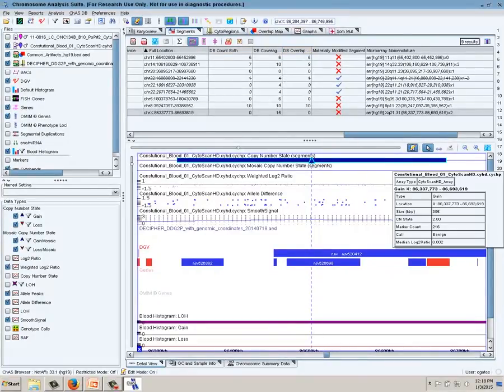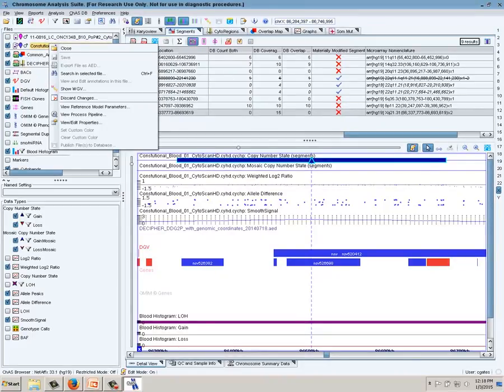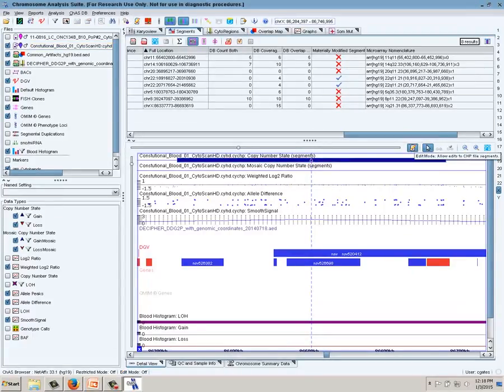If I go to publish by either right-clicking on the sample, you can see publish files to database is grayed out. Or this icon up here is also grayed out. It's just a safety feature, you cannot publish in edit mode. So if it's ever grayed out, you can say, I must still be in edit mode. So go ahead and turn off edit mode.